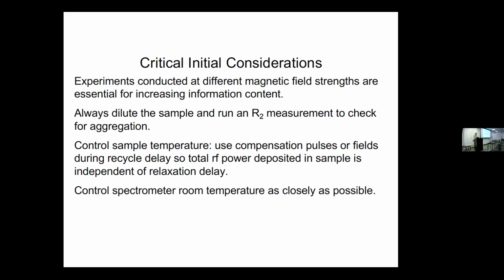Does it have a cryoprobe? No, not yet. Not here. Yeah, this would be the same for a cryoprobe or room temperature probe. Right? I mean, you worry about things like, do I have a quarter wave? Right, matching a quarter wave or half wave and things like this. It's kind of less, perhaps, critical in solution, but the same kind of principle applies.